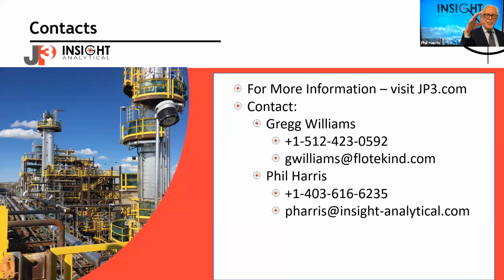As far as the intellectual property of the model, I'm not even sure how to exactly answer that. JP3 retains rights to the sample database. All the samples that we collect and pay for are stored in our database. They are intellectual property, but they're just a bunch of numbers: spectra and corresponding VPCR4 values for those spectra.